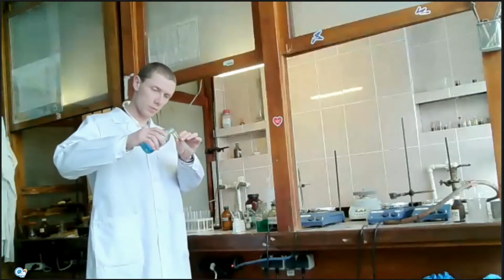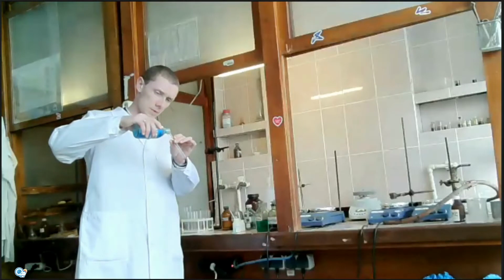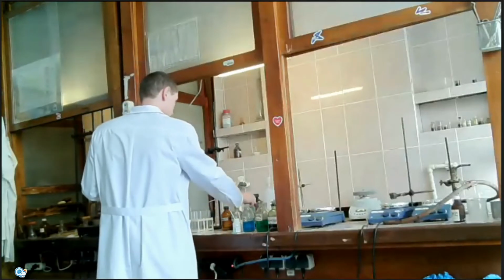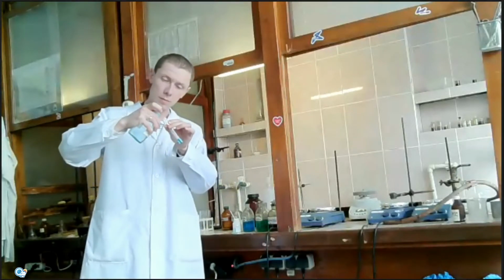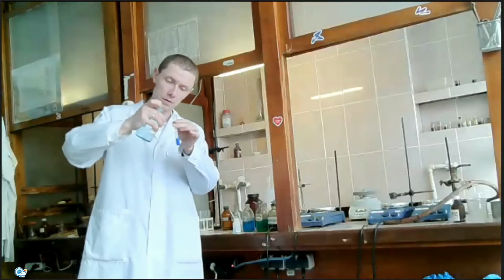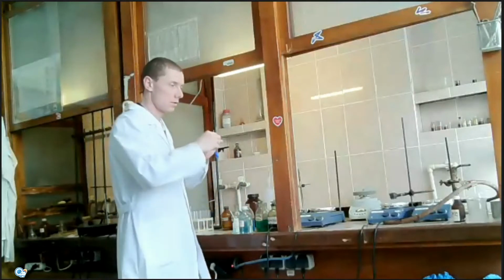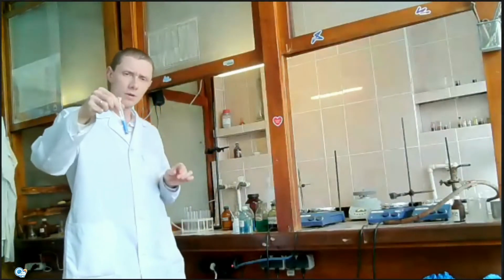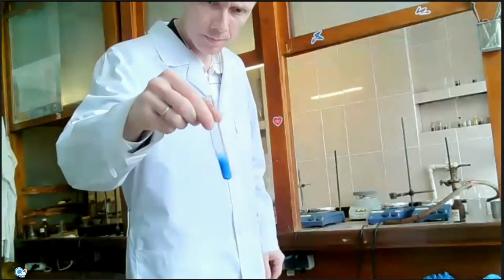Let's take the copper salt and add a small amount of ammonia until formation of precipitation. You can see this blue precipitate.